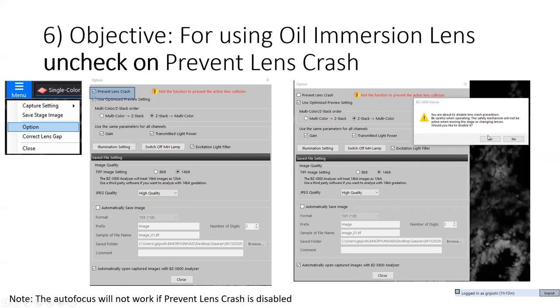And you have to be very careful over here, because when you put a drop of oil, your objective is almost touching the cover slip interface. And at that point, you want to slowly and gradually go towards the sample and not overdo it, or else that will be a bit of stress on the objective, okay? So we will look at this tomorrow in action.